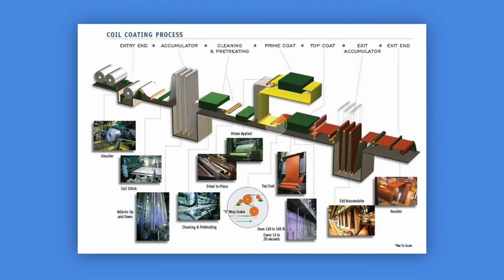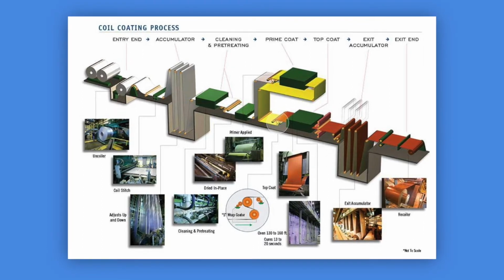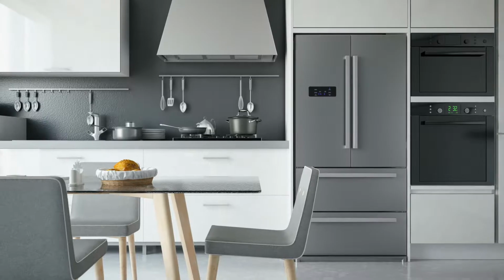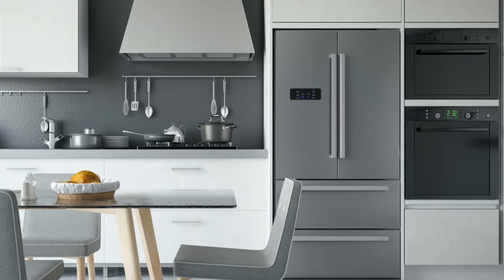Coil coating is an automated process used to produce cost-effective, environmentally friendly, quality products. When coils are fabricated into a product such as metal garage doors, metal building panels, and refrigerators, the pre-painted metal must demonstrate suitable flexibility as the final part of the fabrication process.